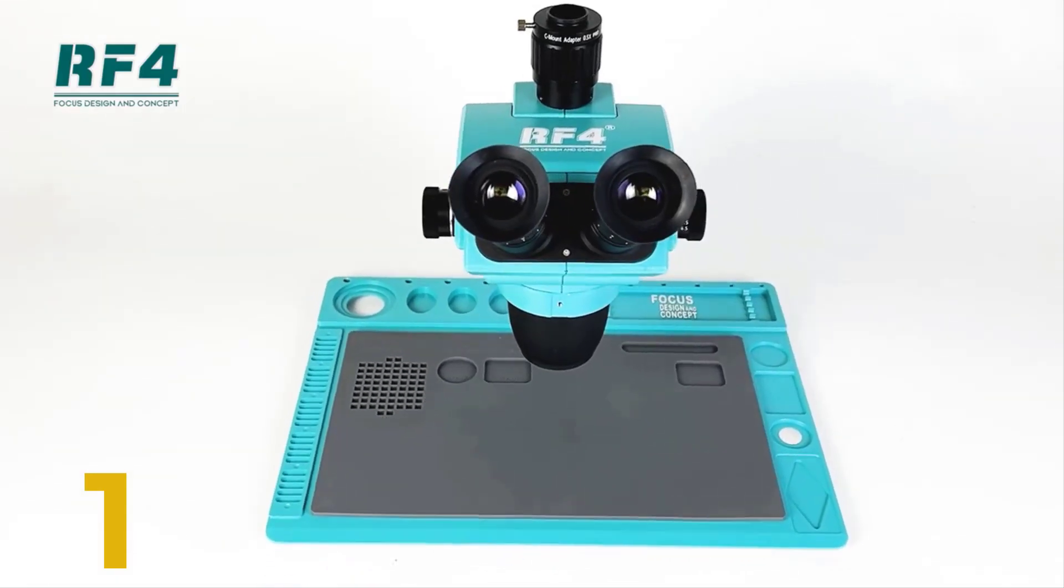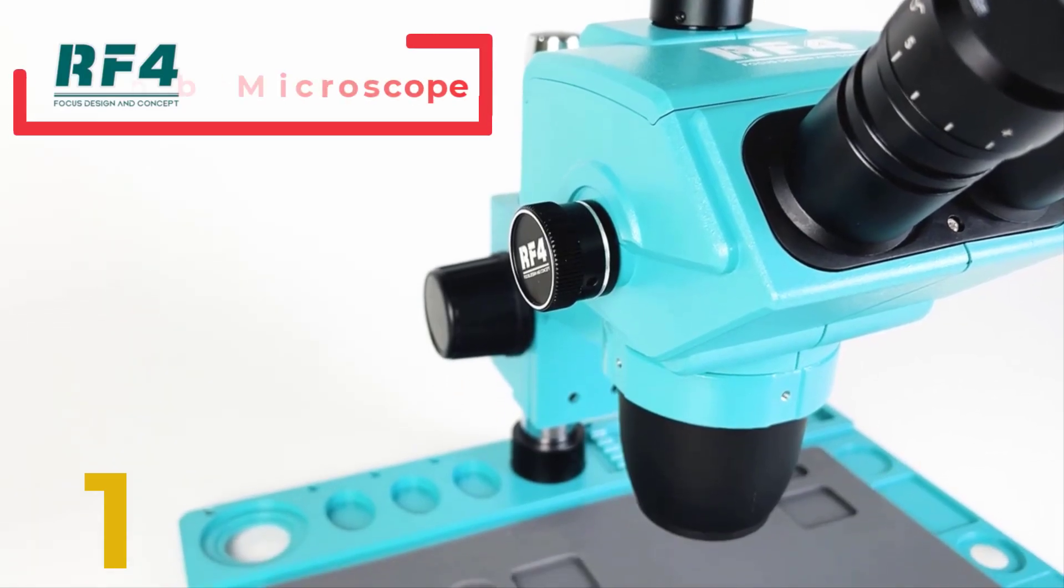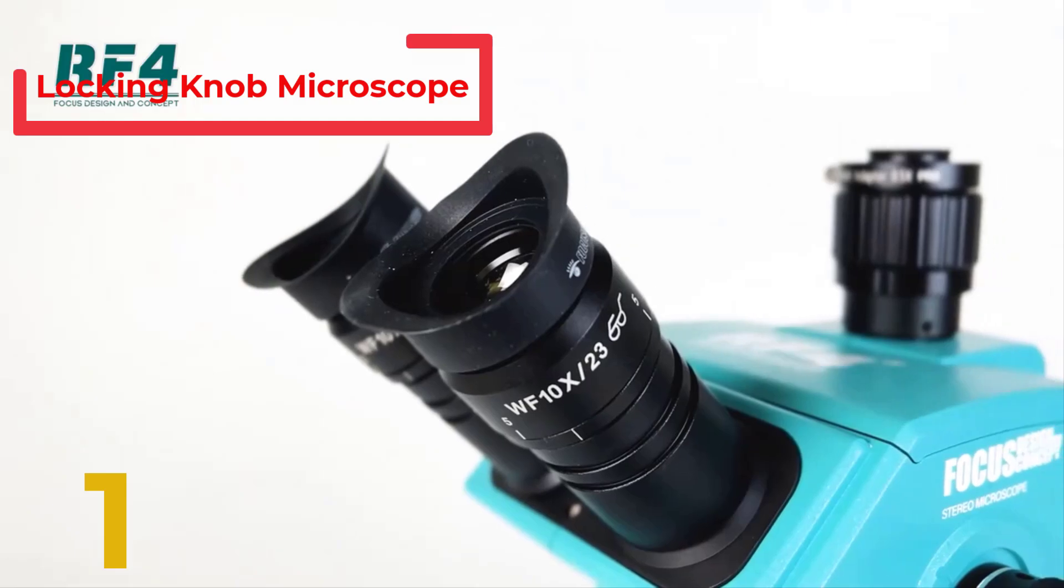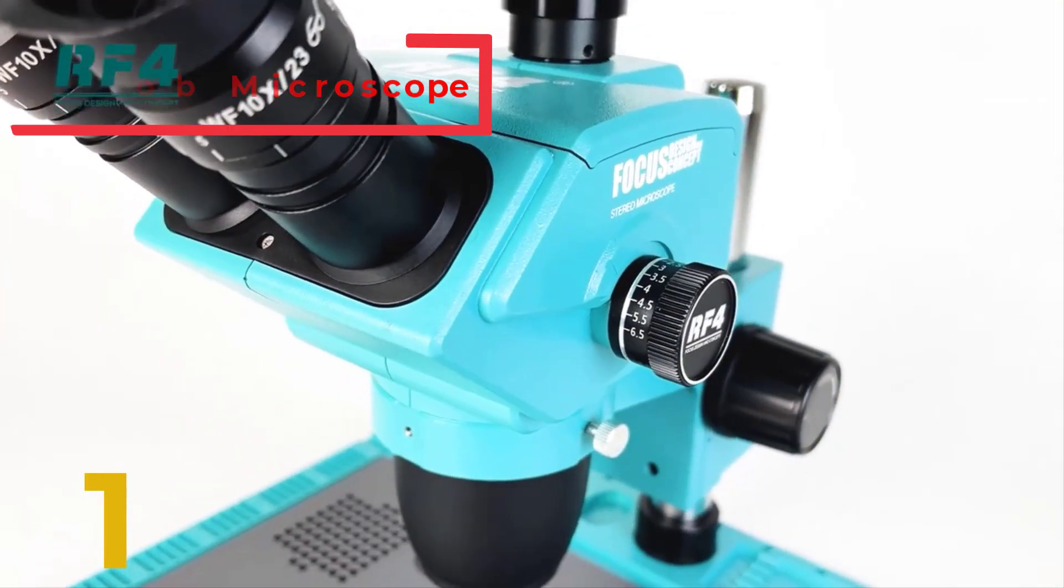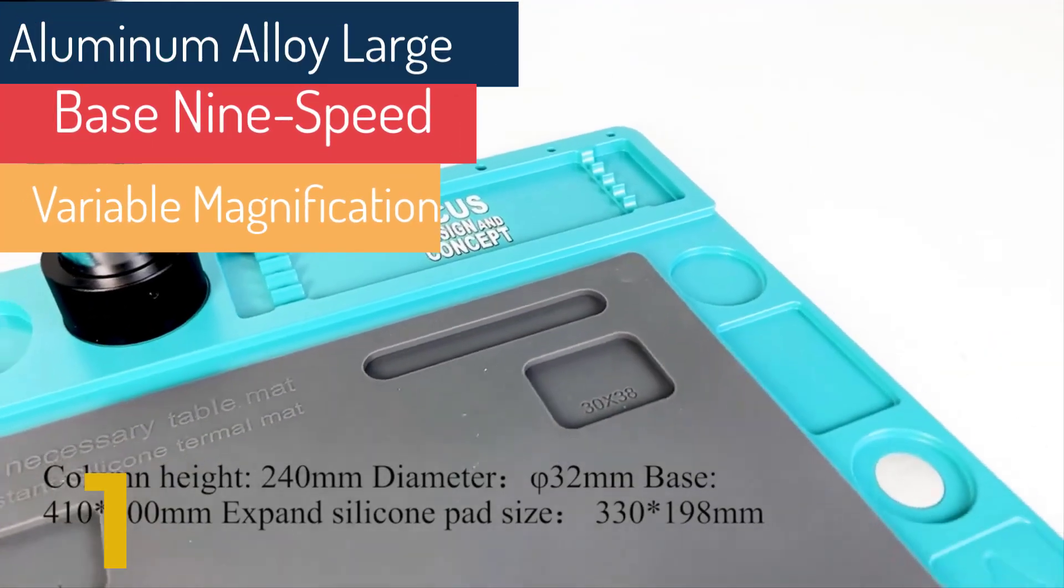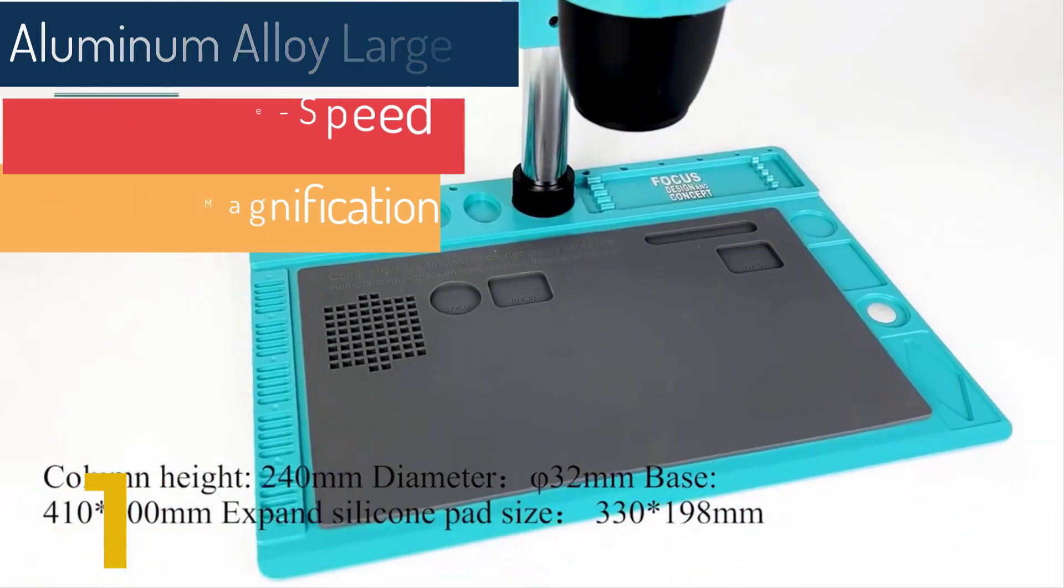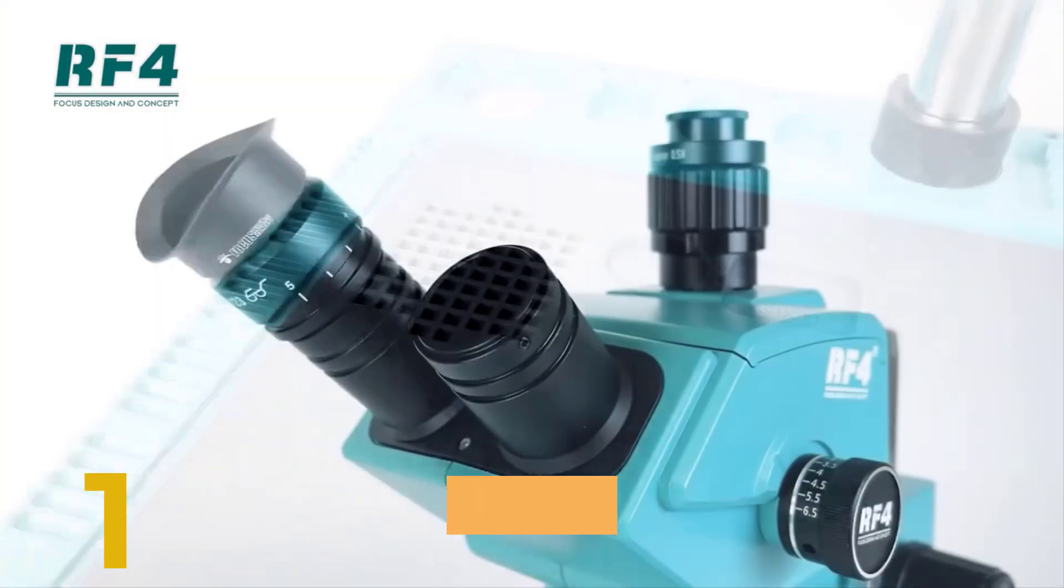Introducing the RF6565 P-Rod E2 microscope, aluminum alloy large base with 9-speed variable magnification and locking knob. Are you looking for a top-notch microscope? The RF6565 P-Rod E2 model offers exceptional features that make it ideal for both enthusiasts and professionals. With its upgraded functions, it stands out as a leading choice for detailed and precise observations.